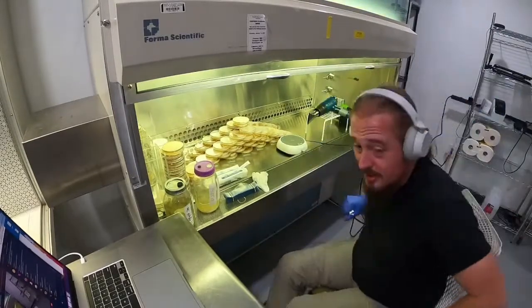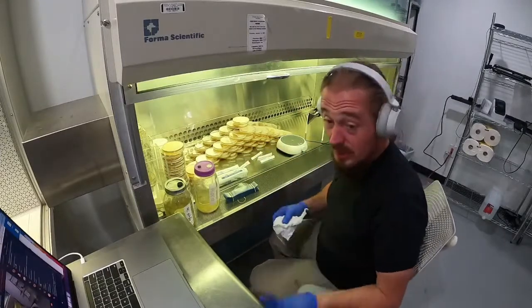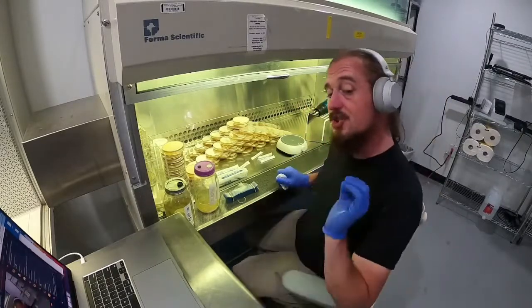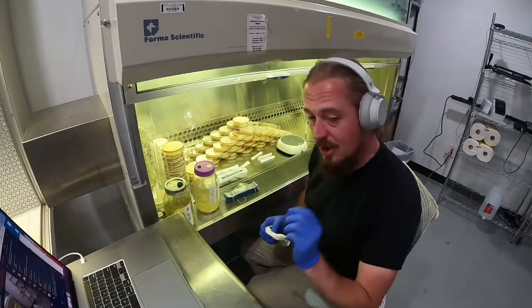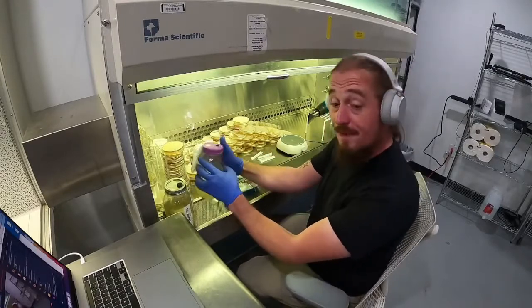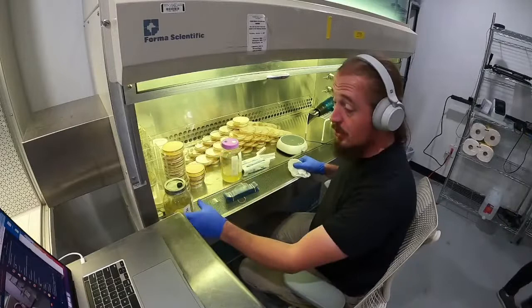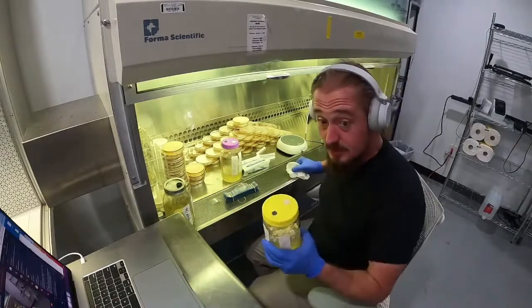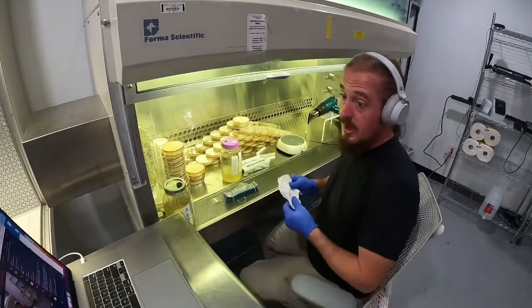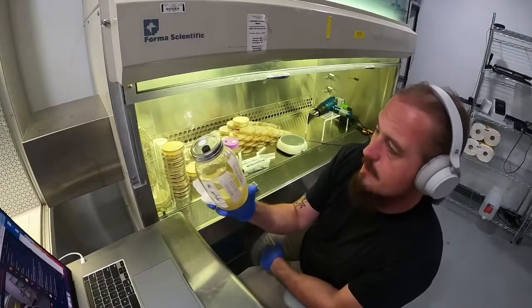So that's why your liquid culture recipe is kind of neither here nor there. It's whatever works. But I really like honey because it's sterile by nature. And it actually has something that's super critical to fungal development: bacterial avenues. In other words, it's got the right chemicals and the right acids and sugars to help the fungi attract and generate the bacteria that they're paired with. So that means I can get things like morels and agarikon to fruit in vitro. And also, the shelf life on honey is bloody amazing. Like, this one is from December 19th, 2020.